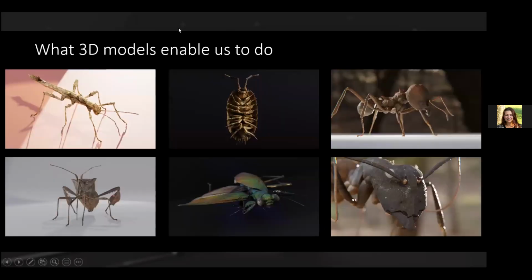And let's now actually have a look at what kind of things we can do with the system now that everything is in place. Now, first of all, we have quite the range in terms of the different sizes that we could potentially throw into a scanner. And obviously, the models at this point are still relatively static. And while for applications such as we want to do take measurements from these scans, those can be 1D, 2D, or even 3D. If we care for volume measurements, for example, this will be perfectly fine to have a static model. The same goes for general conservation efforts. So if it's just about digitizing these specimens, we could in theory stop here.